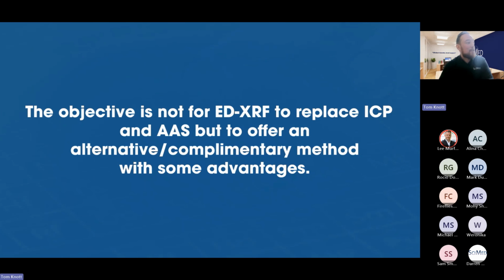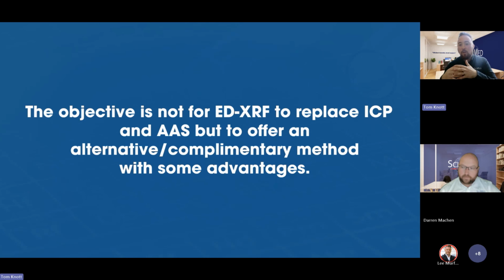And as I've just highlighted, I had to put this slide in as a bit of a disclaimer, because there's certainly colleagues in my organization that will be very upset to hear me saying up with XRF, down with ICP. It's certainly not the message. If anything, what this webinar will highlight between myself and Darren and in general is the collaboration and complementary support different techniques offer. And it's highly unlikely you're going to find a singular magic bullet technique to answer all your questions. And thereby, yes, you might get around some of the disadvantages with consumables and sample prep with ICP by screening with the XRF, but tools like ICP are not going to be replaced by another method.